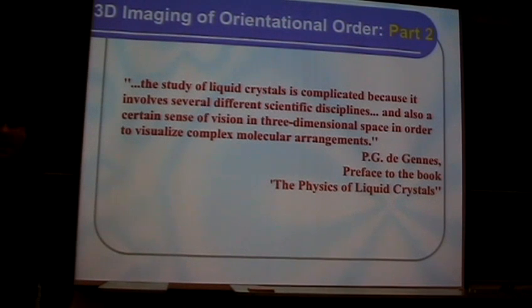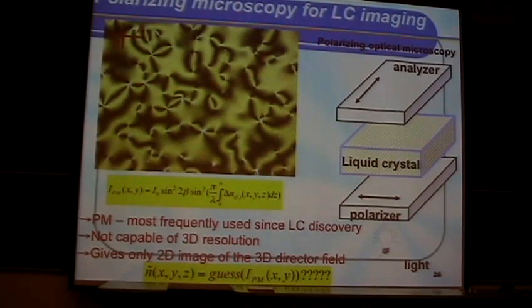So this is exactly what we want to use the confocal microscopy imaging techniques for: to visualize those patterns of molecular orientation, so that some insights into the structures of orientational order in those systems can be obtained from experiments using the fluorescence confocal microscopy technique.